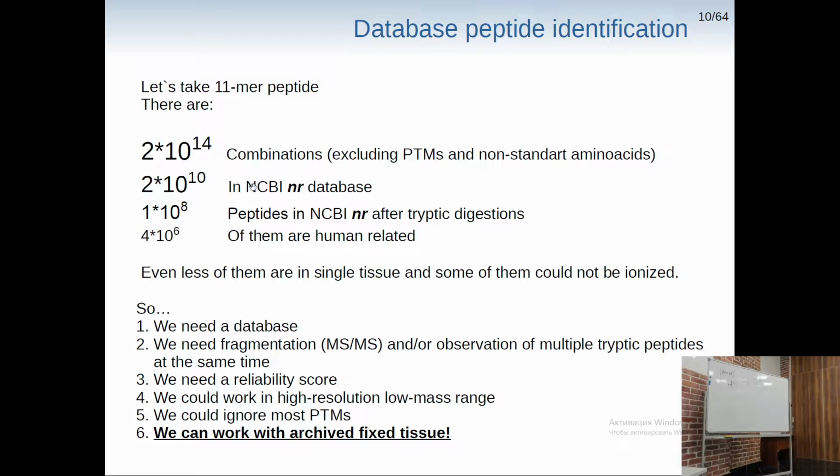But if we shorten our list to only peptides which can arise from trypsinization, how can we actually select which peptides can arise from trypsinization and which can't?